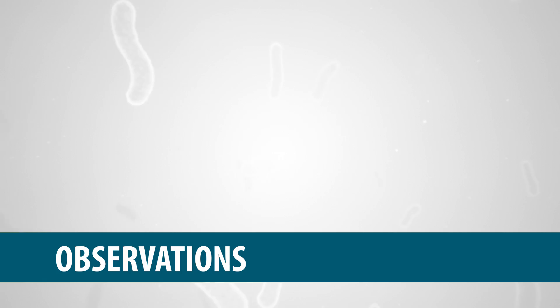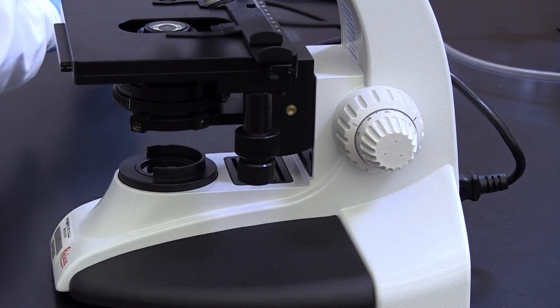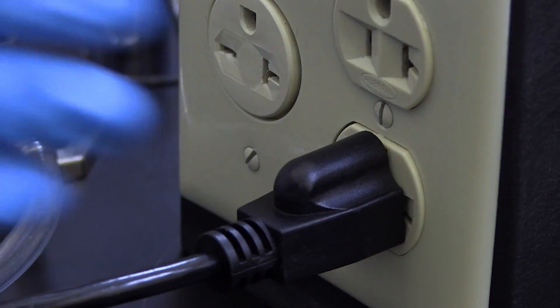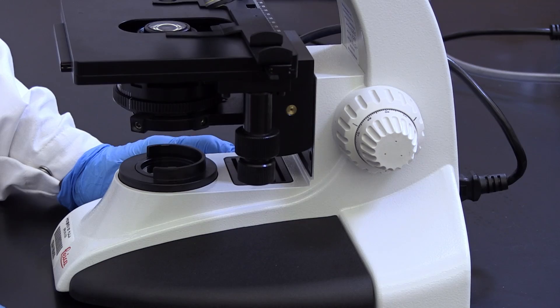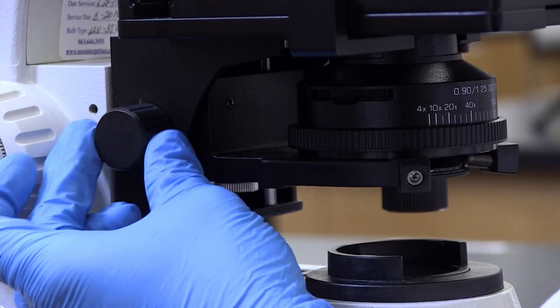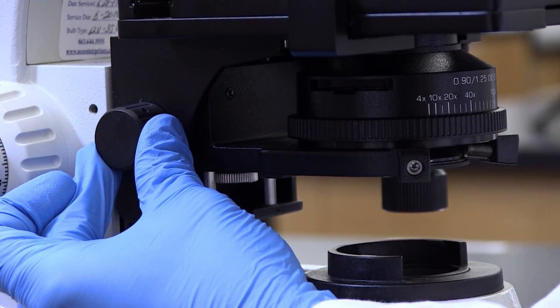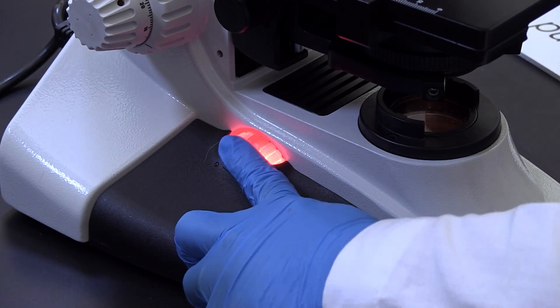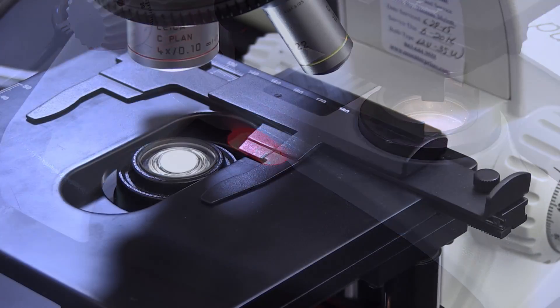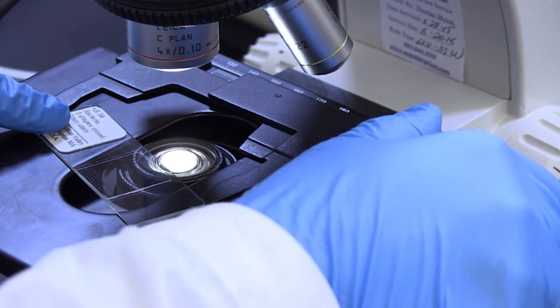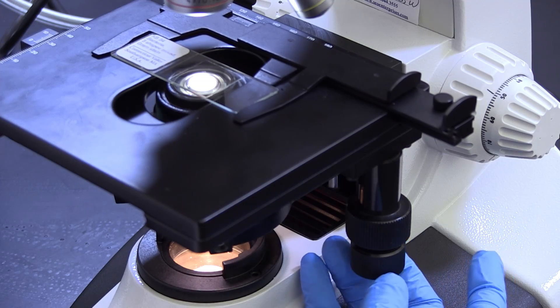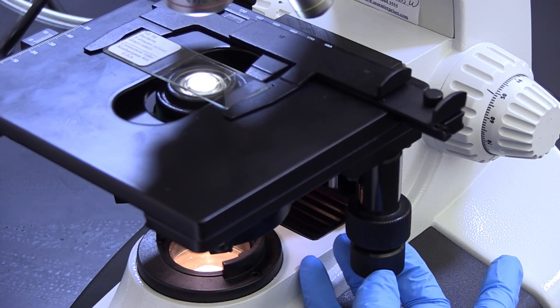Observations. Carefully carry your microscope to your work area and place it gently on the bench top. Plug in the microscope and turn on the light source, keeping the voltage control at a minimum. Be sure the condenser is raised to its maximum and the diaphragm is almost completely closed. Increase the voltage to the lamp until the illumination is at a comfortable level. Place a slide on the stage holding it in place with the stage clamps. Be sure that the specimen is on the upper surface of the slide. Center the slide over the light beam emanating from the condenser.